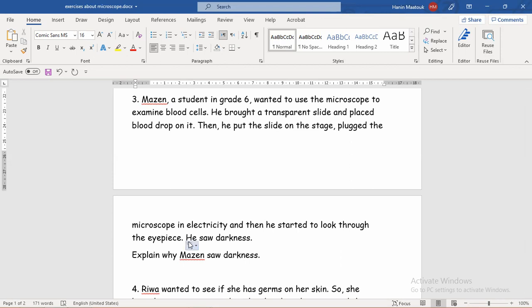But the surprise was that he saw darkness — he didn't see anything. The question is: explain why Mazen saw darkness. Everything he should have done, he did — he put the sample on a slide, put the slide on the stage, plugged the microscope into electricity, and then looked through the eyepiece but didn't see anything. Why do you think this happened?